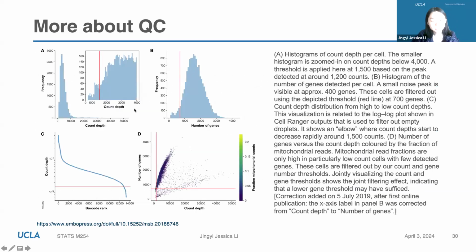Okay, so this is figure 2 from this paper, which shows how the thresholds were set. But I'll leave this for your judgment because to me, I have some questions. This is based on the UMI count thresholding. So this is the distribution for all cells, for all cell barcodes. But looking at this, you may see it's a unimodal distribution. Where do I set the threshold, the low threshold, right? To filter out the empty droplets.